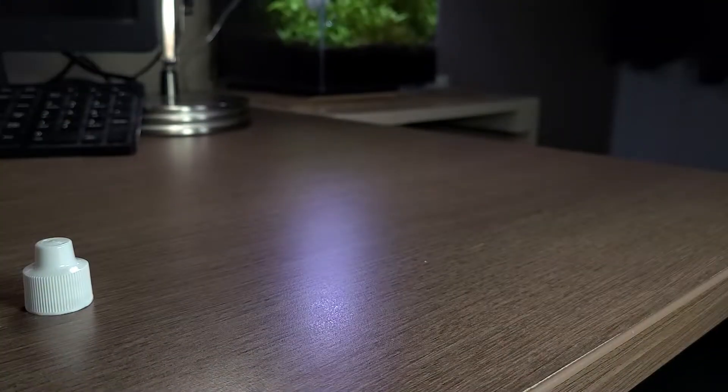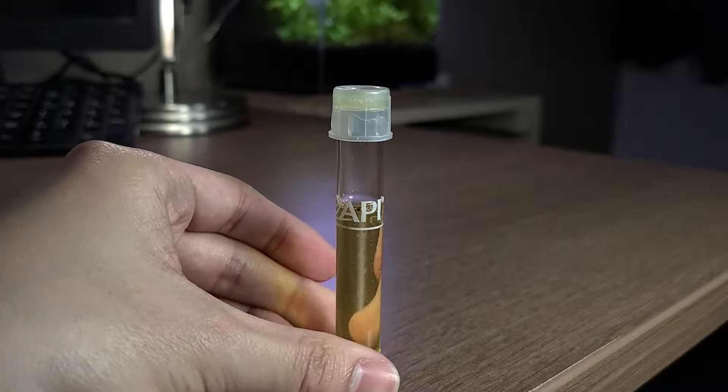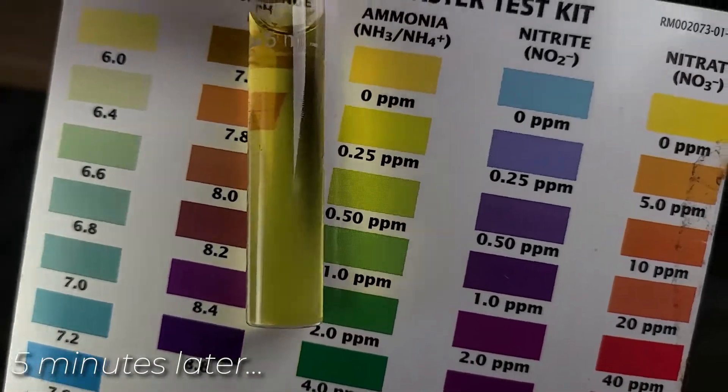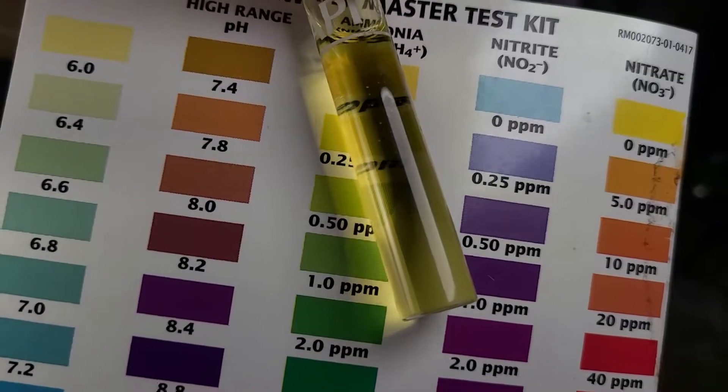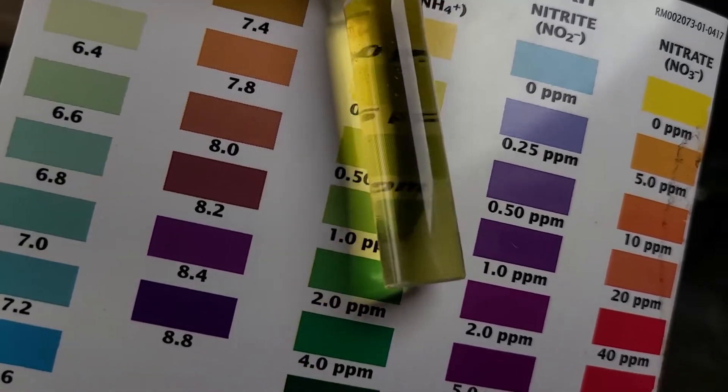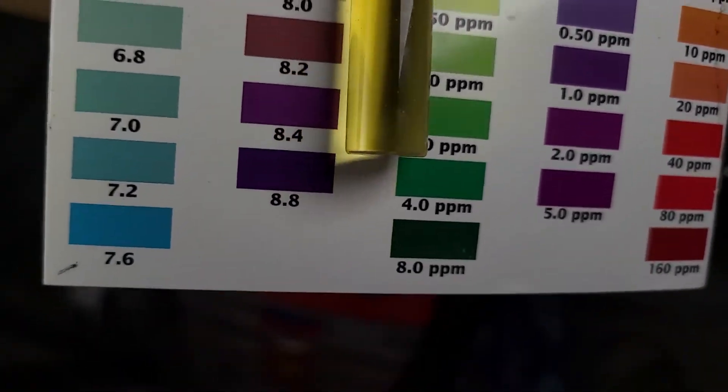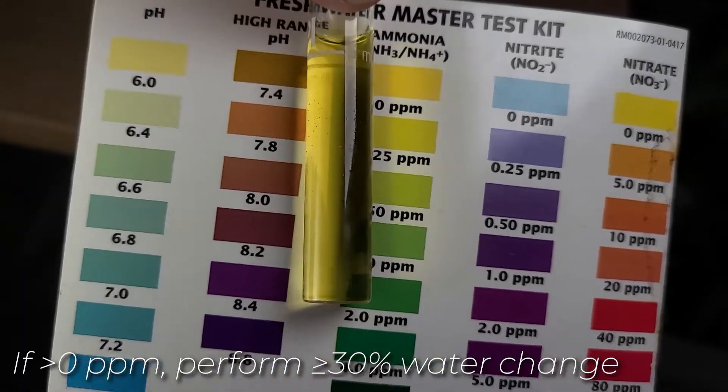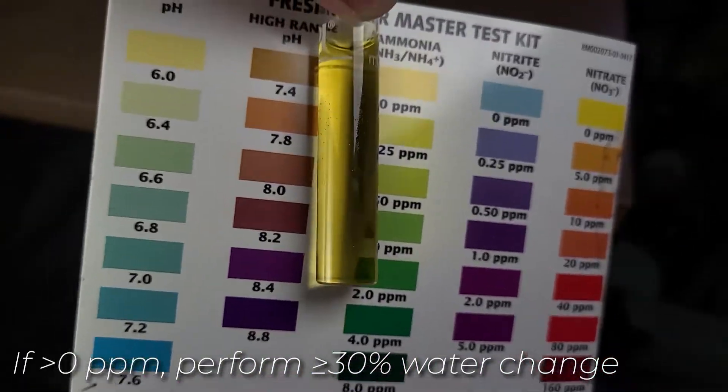Now, we have to wait for about five minutes for the color to develop. This water has zero ppm of ammonia. This is good as you want zero ppm with an established tank. If it's any higher, do a 30% or more water change to remove some of it.